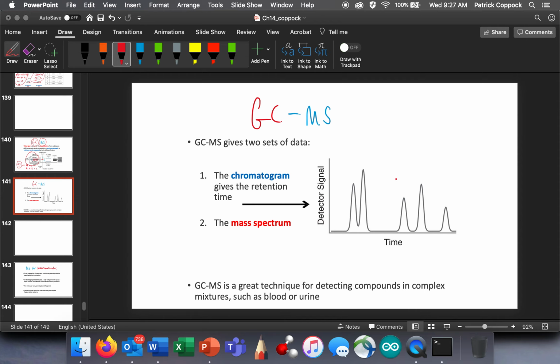That would be, if in the components, I used A, B, and C a minute ago, but suppose we had 5 components in there, A, B, C, D, and E, and that would tell you how much E you had in there, how much D you had in there, how much C, and so on. Can you see that you've got B, you've got the most, right? Now it looks like these two have not been separated very well. Actually, if this is time, it looks like A is coming out of the column first, right? Because that's the fastest time. And then B comes out, and so on.